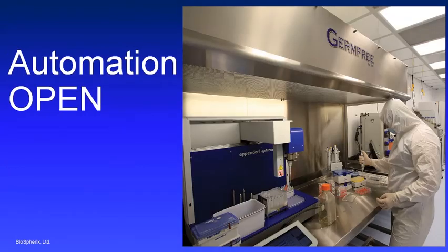So in reducing variability for cell processing, a lot of people are turning to automation. Particularly if you have a high throughput application, you're going to need some automation in your processing.